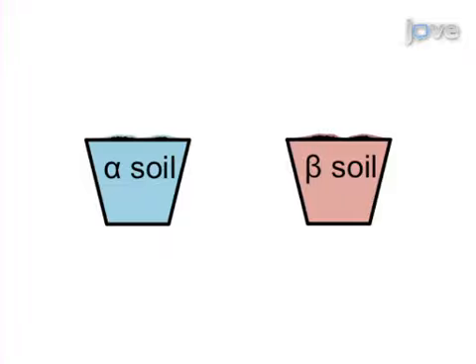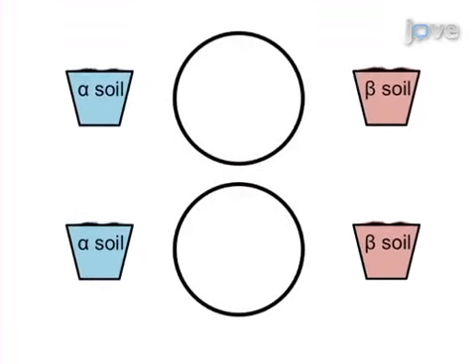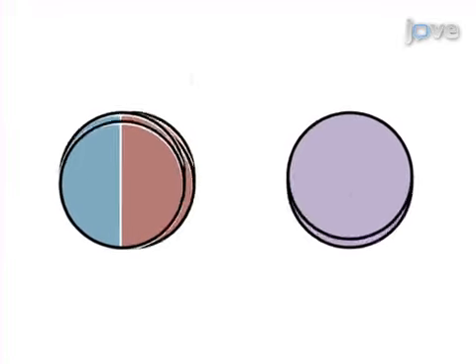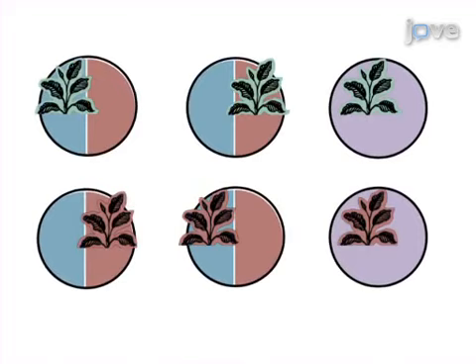types of plant-influenced soils. As a second step, soils from each focal species are placed in separate patches within a pot, or mixed throughout the pot, creating a heterogeneous or homogeneous soil treatment, respectively. Next, the focal species are planted in each soil patch type to assess plant performance in heterogeneous and homogeneous soils.